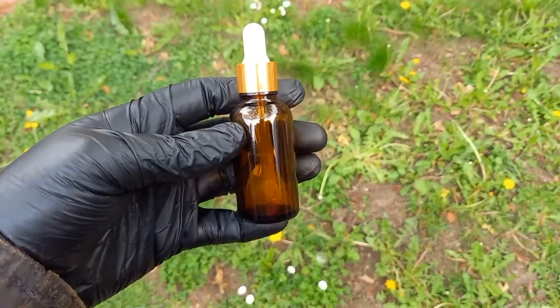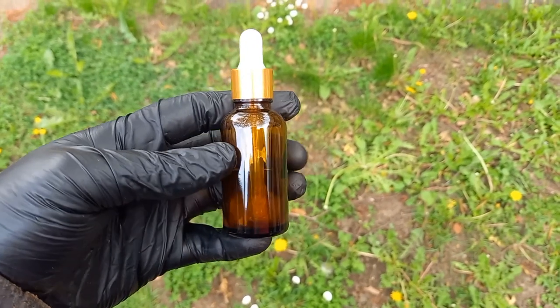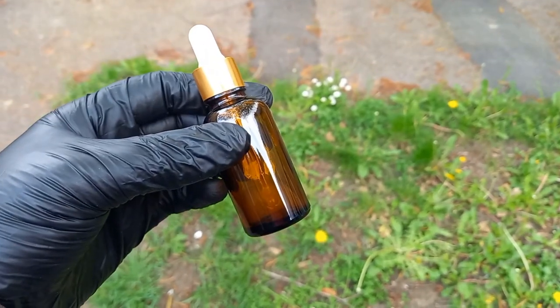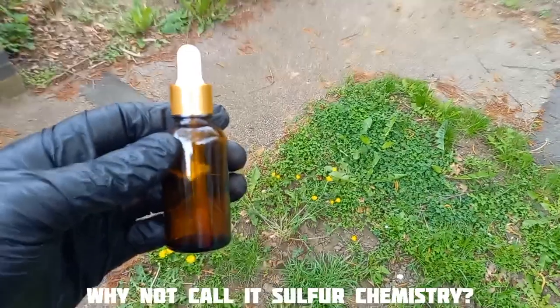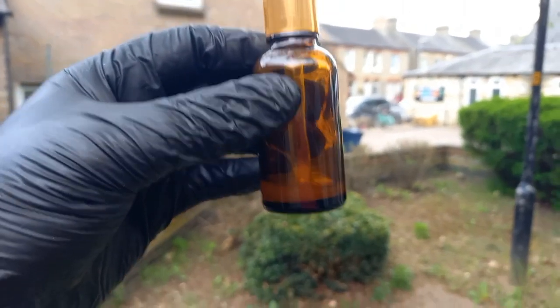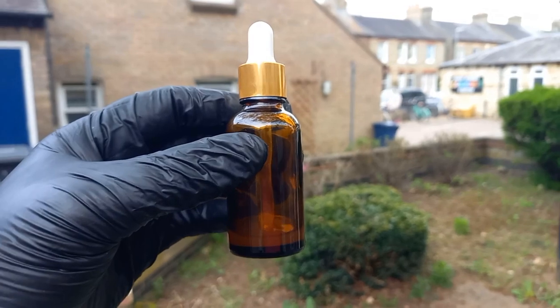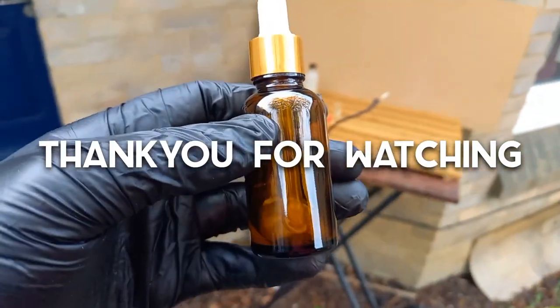This has been white phosphorus in carbon disulfide. I'll do some more carbon disulfide chemistry using sulfur as well. This stuff shouldn't be allowed to evaporate unless you want it to burn something. I'll keep this in the fridge.